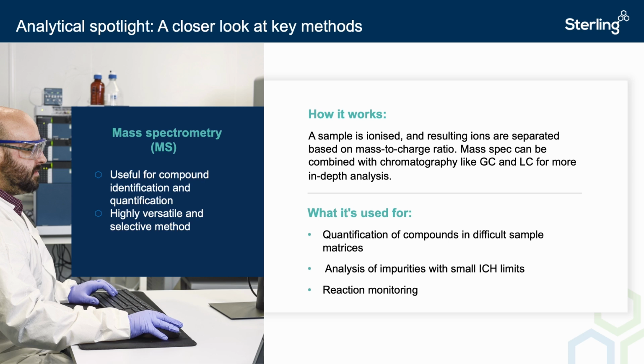Ions with different mass-to-charge ratios will be deflected differently in the detector and can be filtered out by mass of interest. This can be used to select a specific mass, i.e. from the analyte of interest, for further fragmentation. The selected ions are then subjected to another round of collision and ionization before being sent through another separation mechanism such as a quadrupole or time-of-flight detector, which can quantify the different masses and fragments detected.